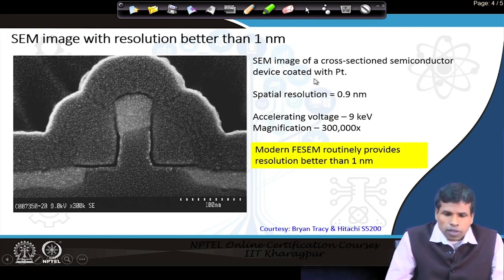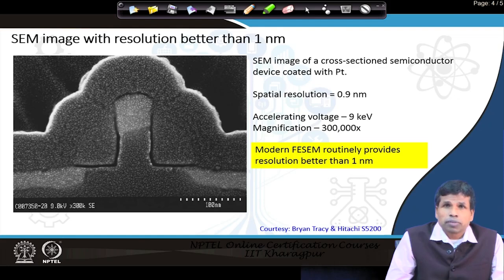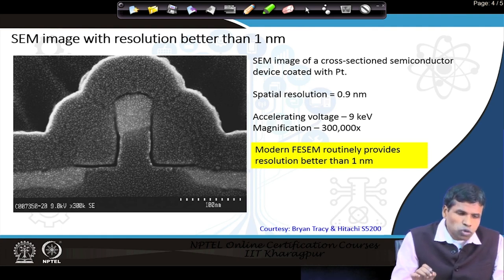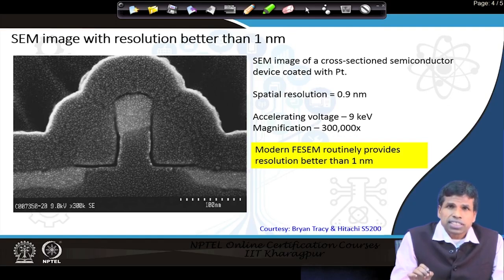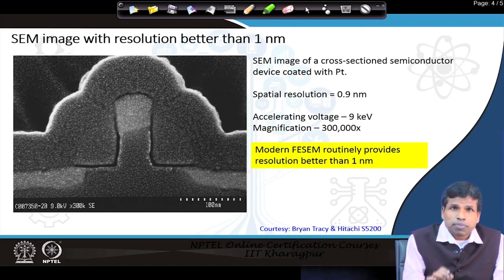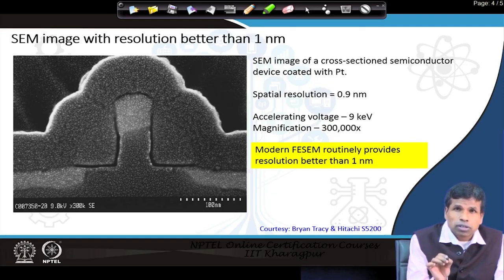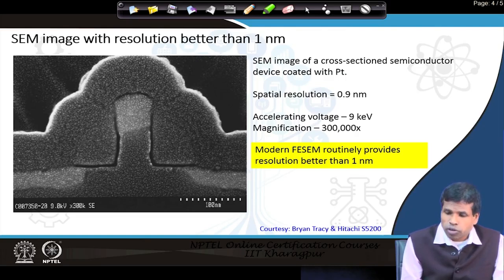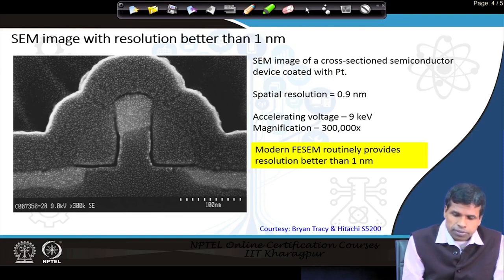Here is an SEM image showing spatial resolution better than 1 nanometer. Resolution means the minimum distance between two features that we can distinguish as separate entities. As you see in this image, there are many bright dots, and the distance between two bright dots is as small as 0.9 nanometers. This image was collected at 9 kiloelectron volts with a magnification of 300,000, and all modern scanning electron microscopes routinely achieve this type of resolution.